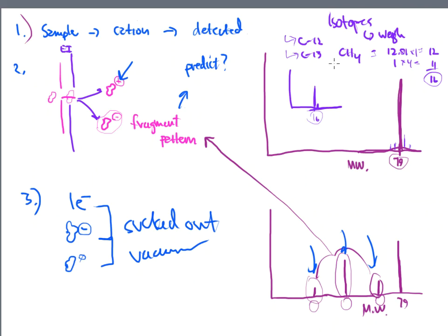Every now and then, a methane group is going to have a fat carbon with it and not the normal skinny carbon that we always typically see. That also happens at every single fragment. So I would see small lines and tick marks to each side down here, but I would also see the same tick marks and lines on each side of those major lines. And this is going to complicate matters just a little bit. Nothing major, but that is why they're going to be present.